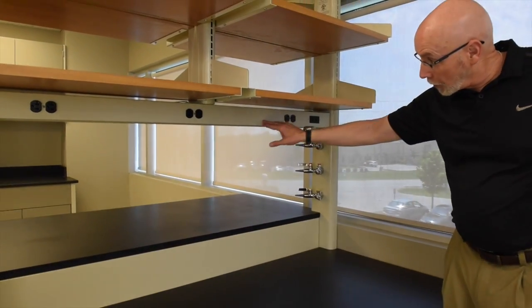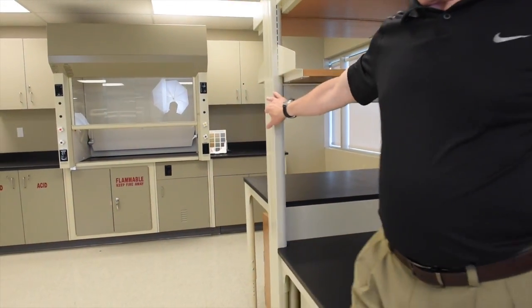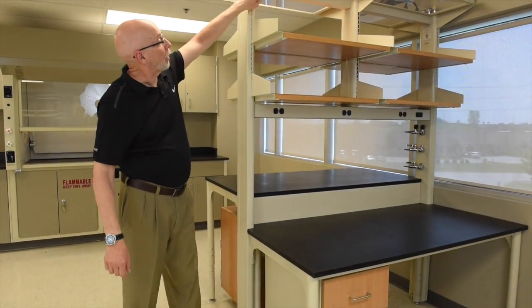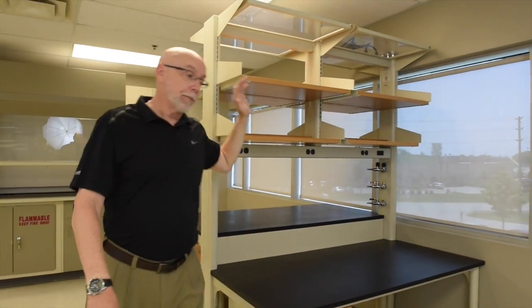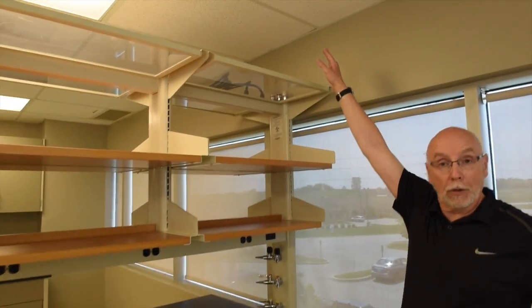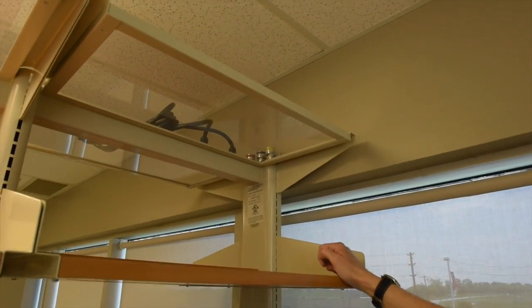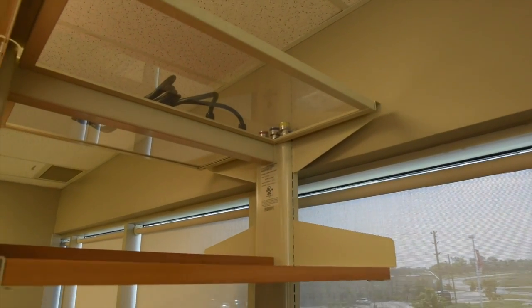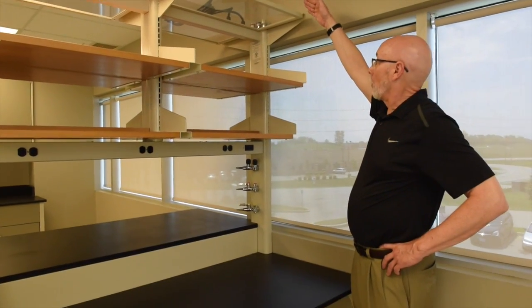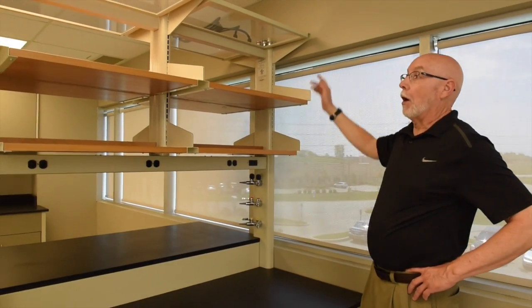The way this works is the electrical goes across here, it goes up this post — this is a removable panel — and then it goes right through here through this tube. There's a strain release over here and the plugs come up and go into the overhead service panel. You'll also see that there are quick disconnects there associated with each of the mechanical lines that go into an overhead service panel, and your data comes from here and goes to the right and up.